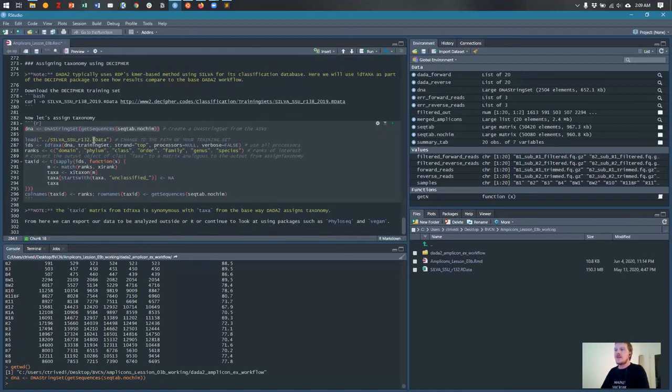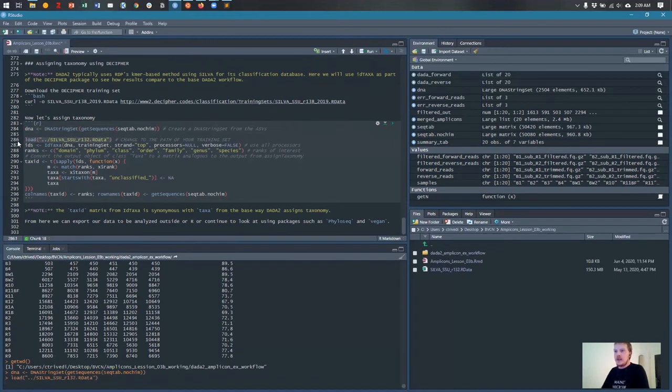And this is just how it's modifying the data to be able to put into IDTaxa. Let's see if I can load that appropriately. And it should load, so the IDTaxa databases are actually in .RData files.